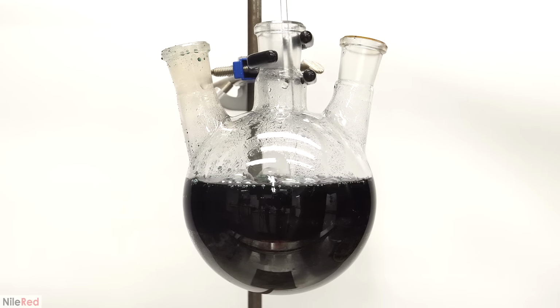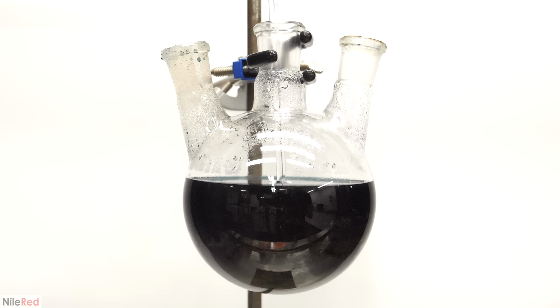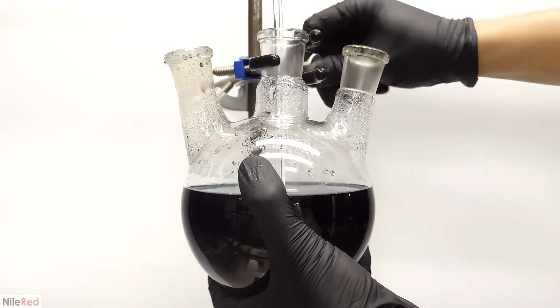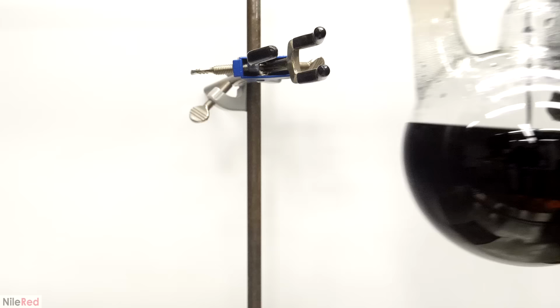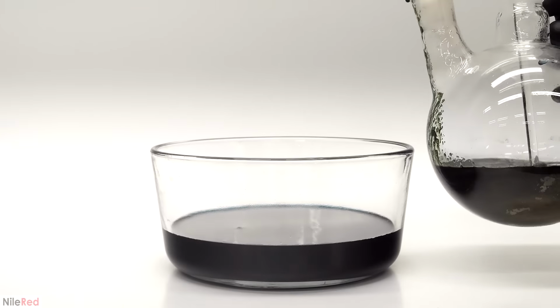With a glass rod, I mixed it around a bit, but because it got so hot, I decided to leave it overnight to cool. This kind of turned out to be a bad idea though, because when I came back the next day, it had completely solidified. There was a solid brick of junk that had formed at the bottom, and I wasn't even able to take out the glass rod. To deal with this, I started by dumping out all the water into a bowl.